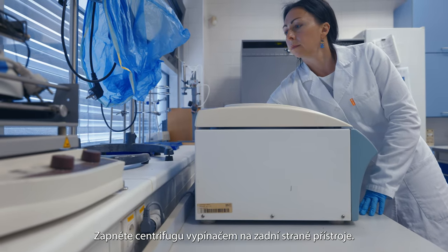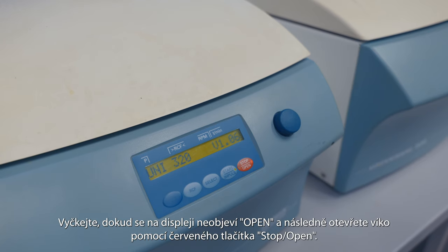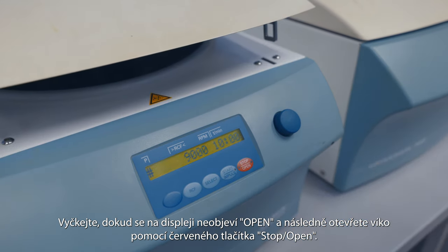Switch on the centrifuge using the switch button at the back of the machine. Wait until 'open' appears on the display and then open the centrifuge cap using the red stop/open button.